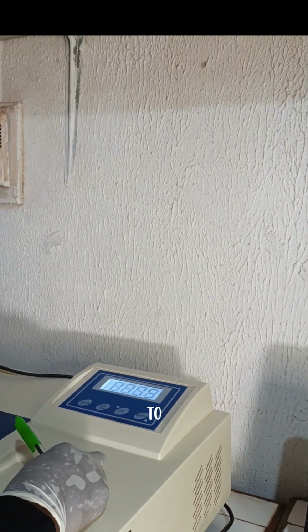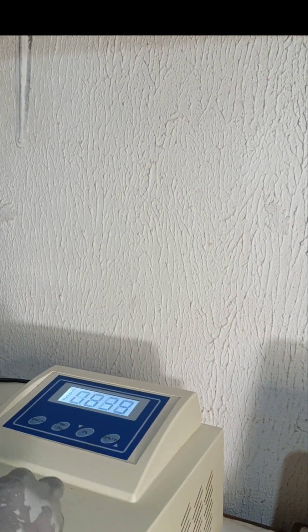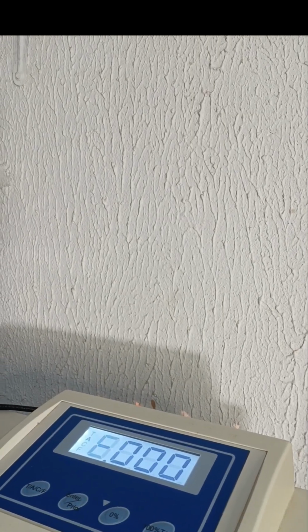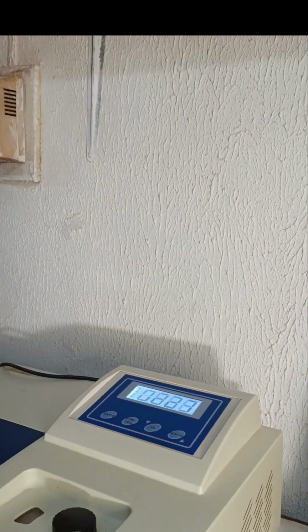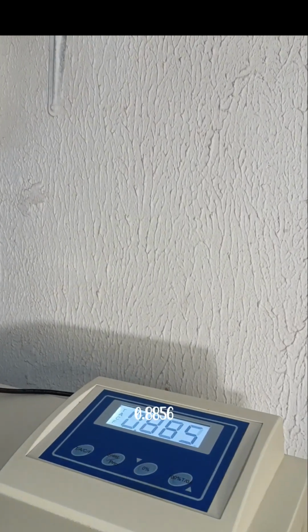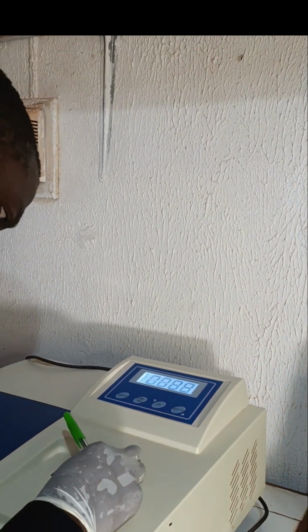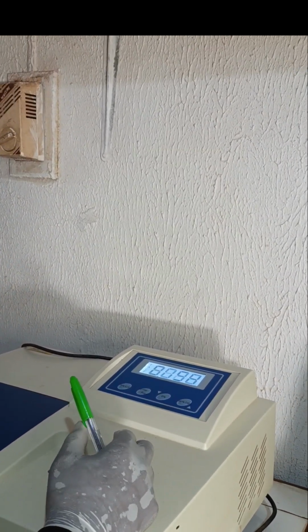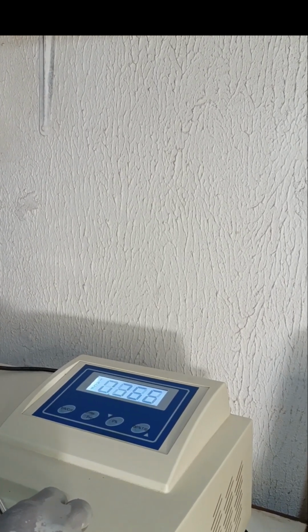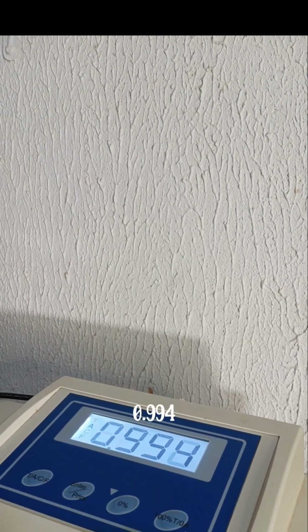Then we shift to 660, get it to be 0.885. 680, 0.994.